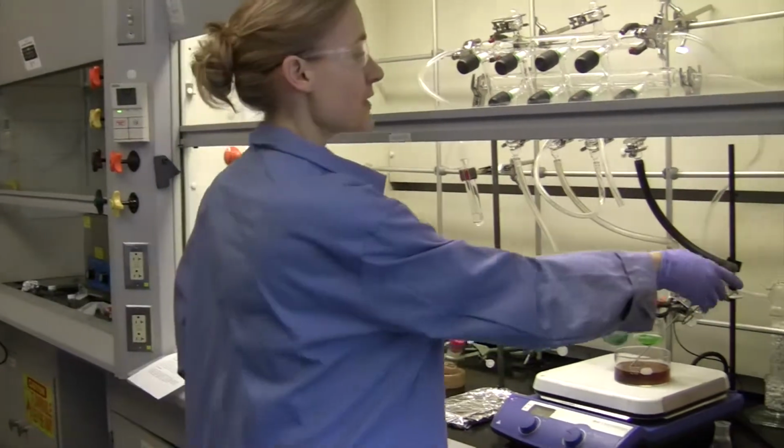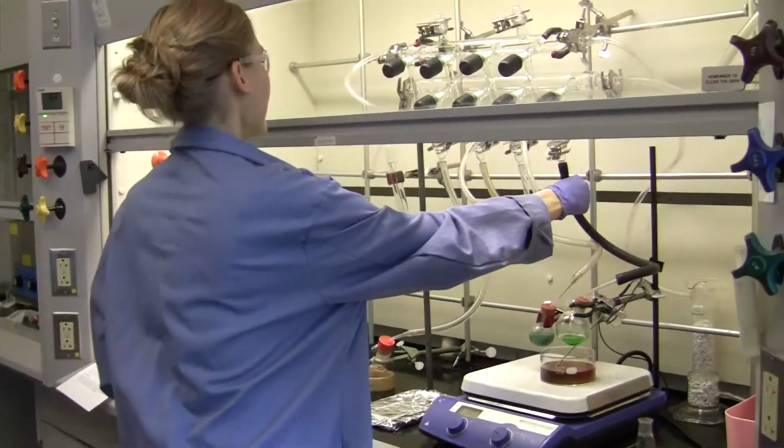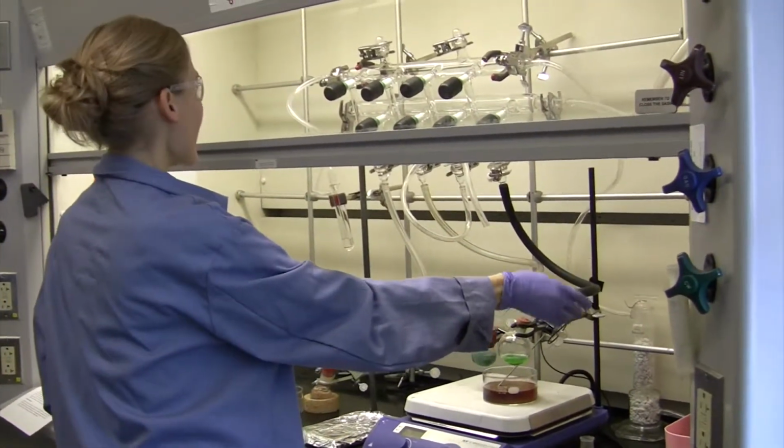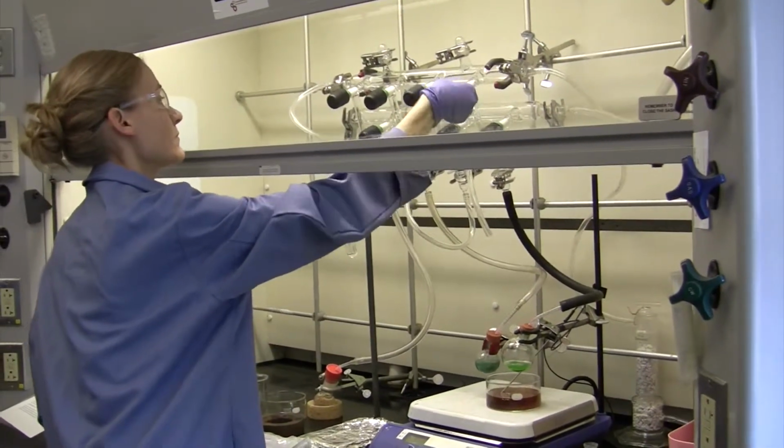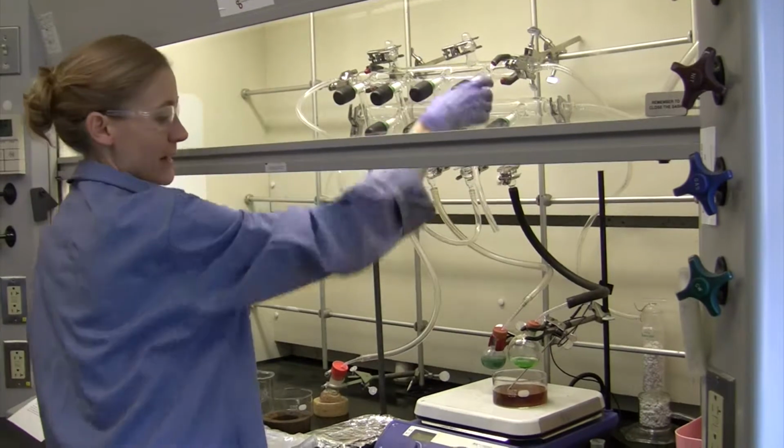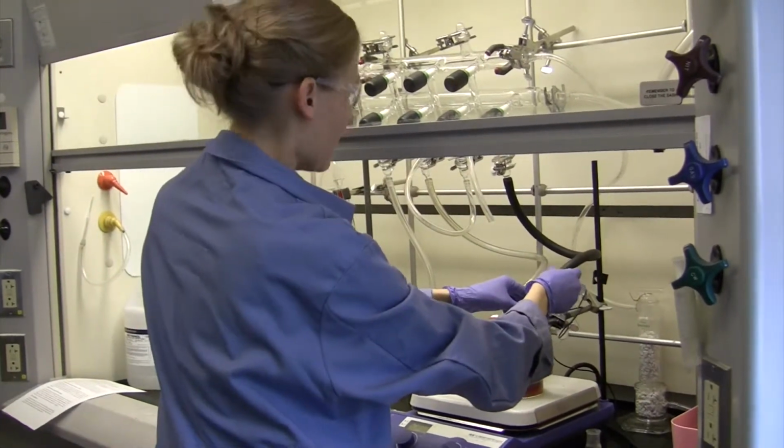So now we'll remove the nitrogen line. So again, this is our nitrogen line, and we'll just close this all the way. We will remove this.